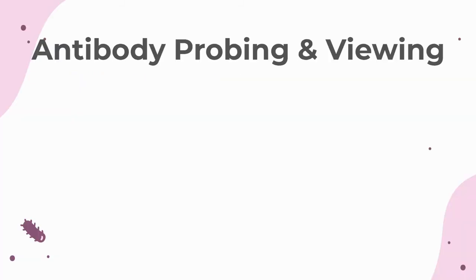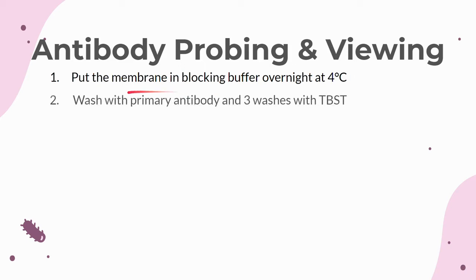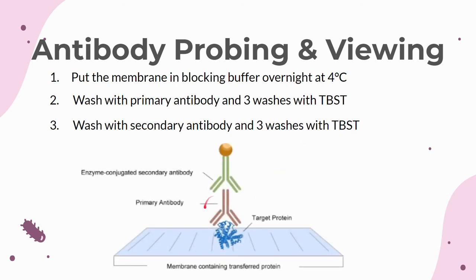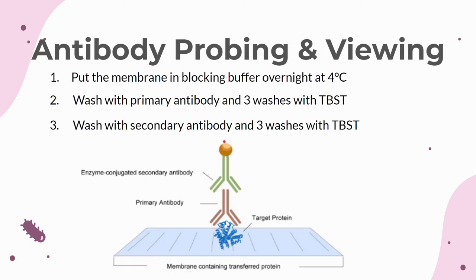The next part of the Western blot process is probing for the proteins with antibodies. The antibodies will bind to and detect the presence of specific proteins you are looking for. First, the membrane is put in a blocking buffer overnight, which prevents any antibodies from binding to the membrane non-specifically. Then wash the membrane in the primary antibody overnight, and rinse off the primary antibody with 3 washes with TBST buffer. Next, wash the membrane in the secondary antibody for an hour, followed by 3 washes with TBST buffer. The primary antibody is specific to a single protein and attaches to that protein on the blot. The secondary antibody attaches to the primary antibody and has a label attached which can be detected with chemiluminescent or fluorescent imaging.